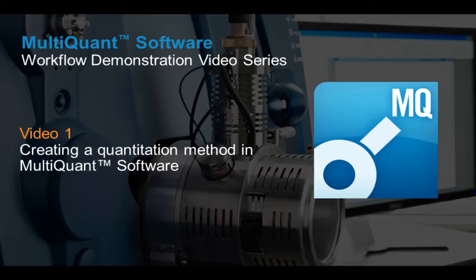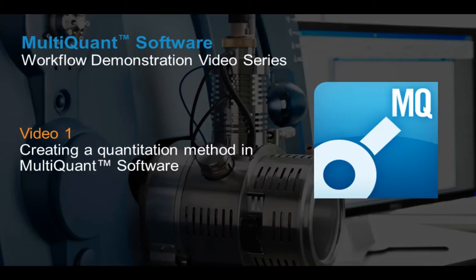Creating a new quantitation method using MultiQuant software is very easy and offers you lots of levels of control over the integration parameters for your quantitative analysis. This short video will demo how you can create a quantitation method in MultiQuant software from your acquired dataset.